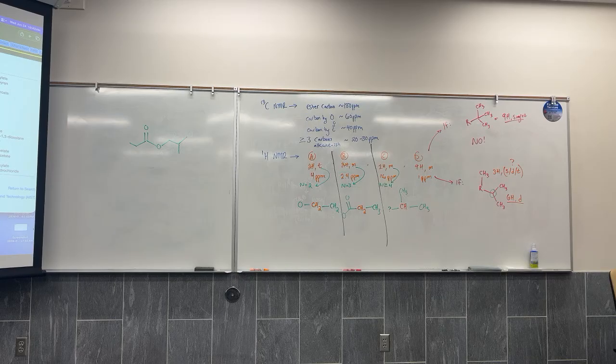All right, well, somebody on the internet is looking at this, laughing at how we didn't get it yet. And by we, I mean laughing at me, but that's okay. I think we'll have to come back to it and try to figure out its structure once I figure out what the mistake was that I made. These have too many carbons, too many hydrogens.